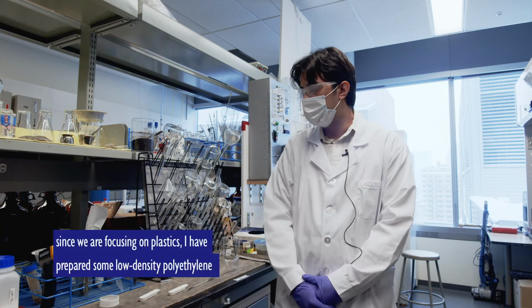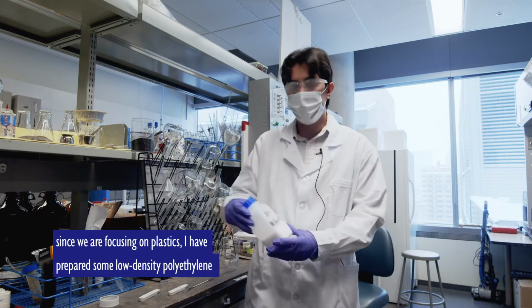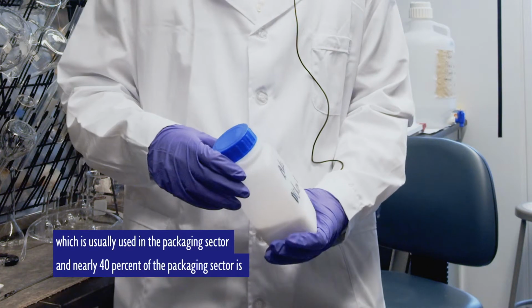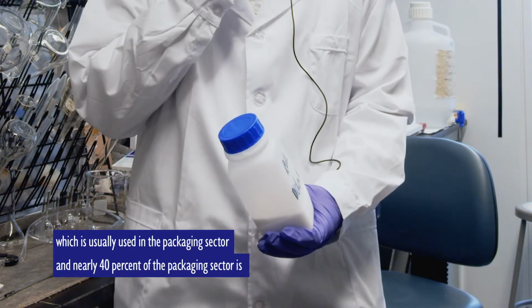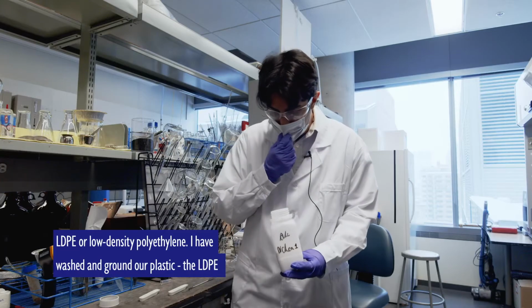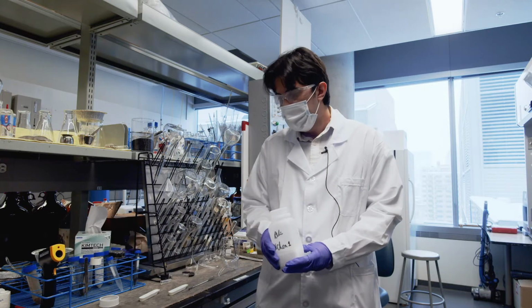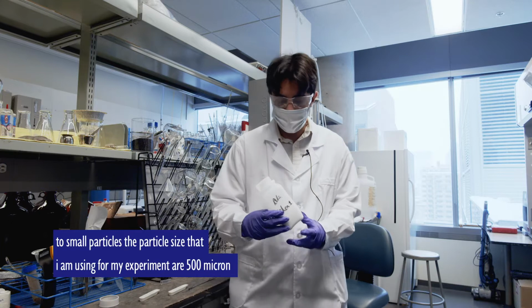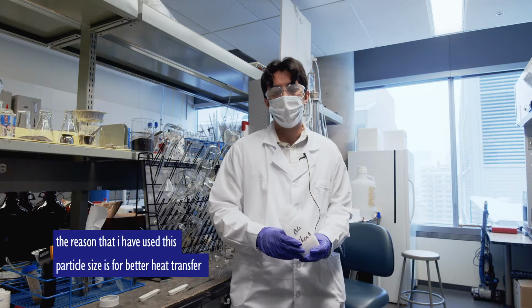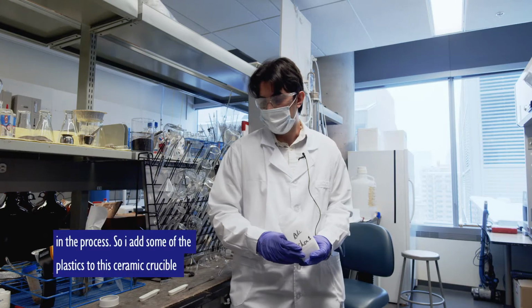since we are focusing on plastics, I have prepared some low-density polyethylene, which is usually used in the packaging sector, and nearly 40% of the packaging sector is LDPE, or low-density polyethylene. I have washed and ground our plastic, the LDPE, to small particles. The particles that I'm using for my experiment are 500 micron. The reason that I have used this particle size is for better heat transfer in the process.